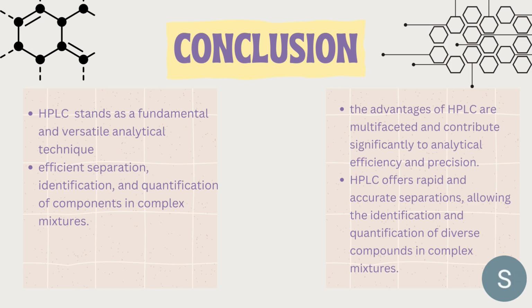Its principles and concepts revolve around the efficient separation, identification, and quantification of components in complex mixtures. The advantages of HPLC are multifaceted and contribute significantly to analytical efficiency and precision. HPLC offers rapid and accurate separation, allowing the identification and quantification of diverse compounds in complex mixtures.